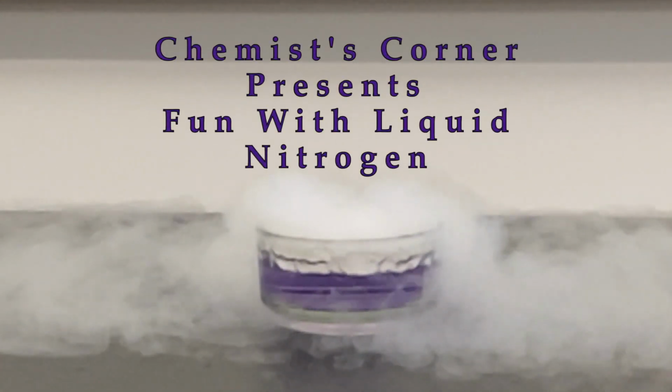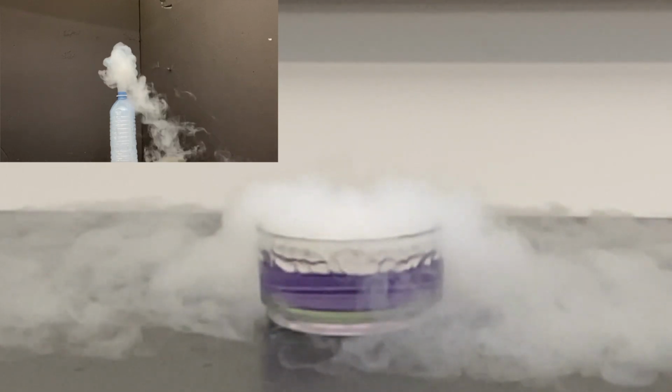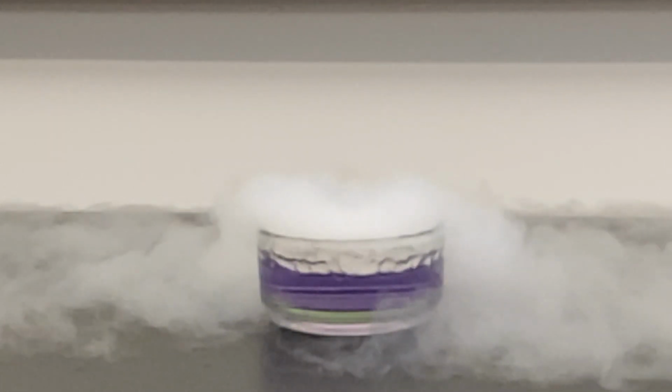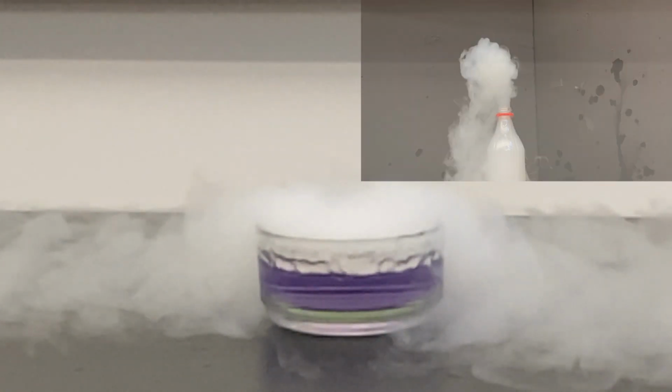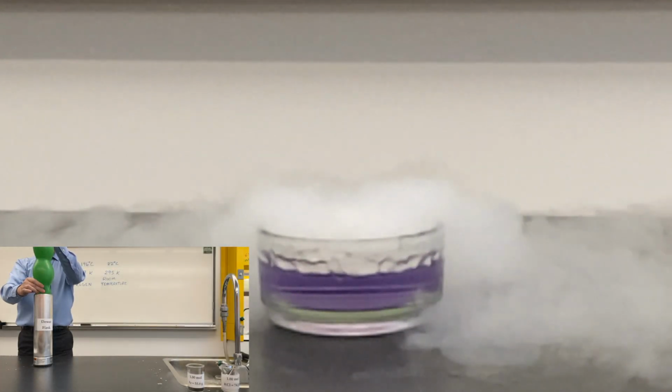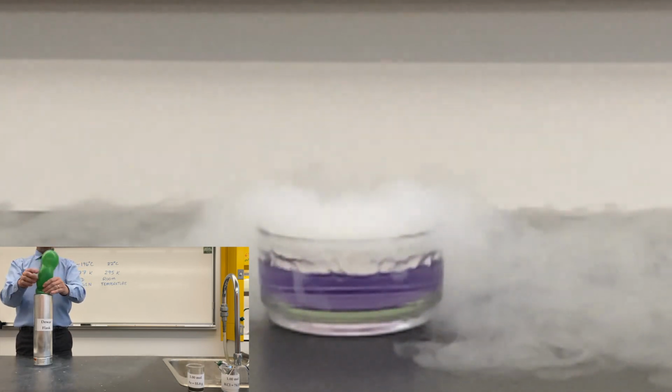Chemist's Corner presents Fun with Liquid Nitrogen. We're going to put some liquid nitrogen in a water bottle. We're going to put some more liquid nitrogen into a Coke bottle. And we're even going to put a balloon into liquid nitrogen and see how much of that balloon I can stuff into that Dewar flask. Stay tuned.